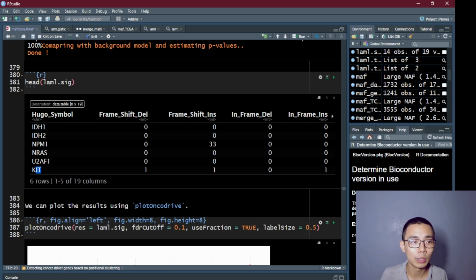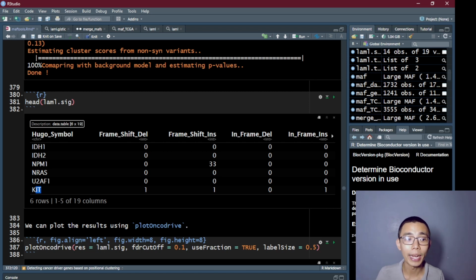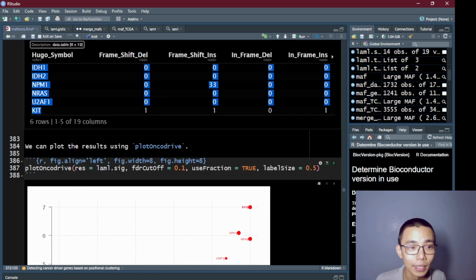We can do that either through downstream mutations, simulations, and perturbation, or some other way that we want to look into. Or simply just check if this cancer driver actually is the same as what people have found previously. That will be the easiest way to do it.